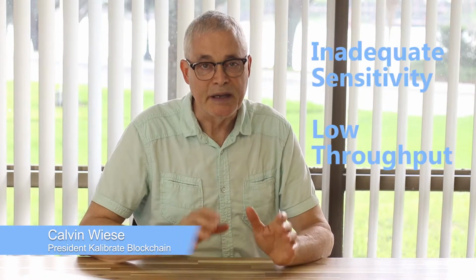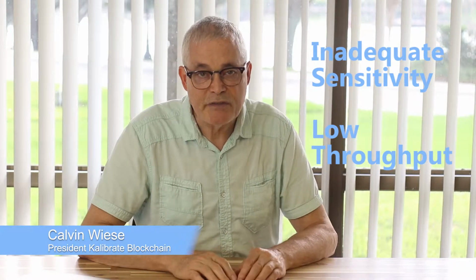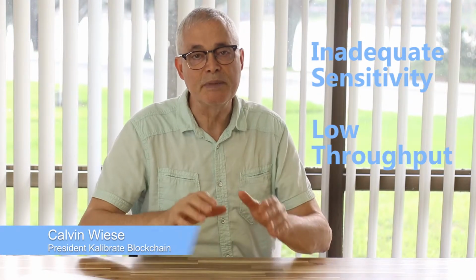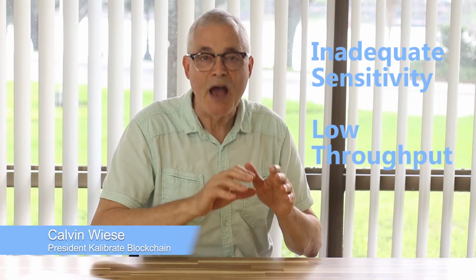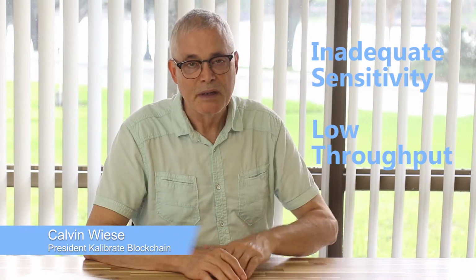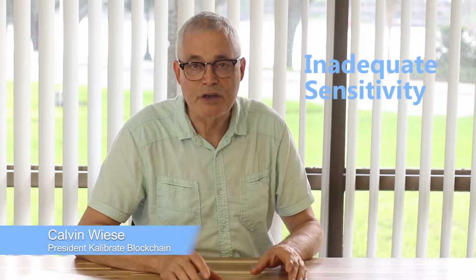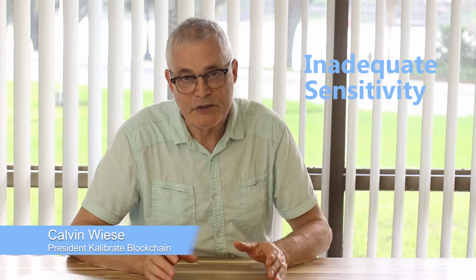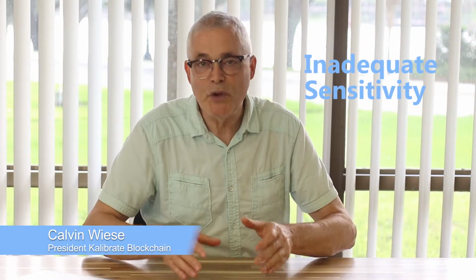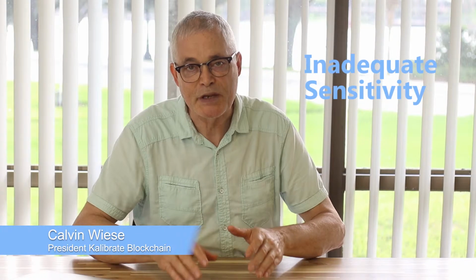This concentrator seeks to address two problems we encounter in mass spectrometry: inadequate sensitivity and low throughput. Sensitivity is the minimum concentration that can be detected. Throughput is how long it takes to detect and characterize a sample. Typical forms of mass spectrometry can't detect low abundance molecules of interest that we call analytes. There are lots of useful and interesting analytes in blood that are too low in abundance for mass spectrometry detection.